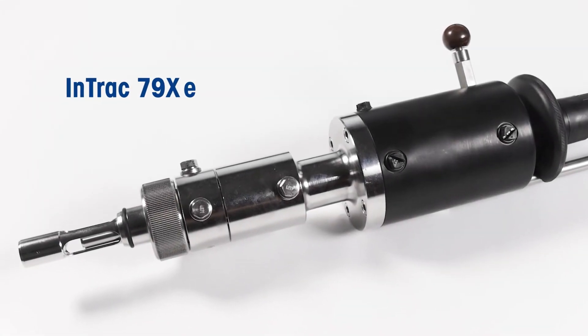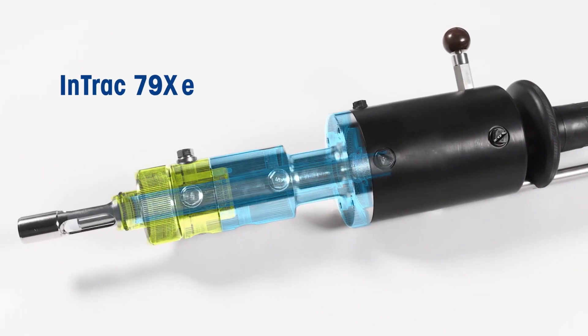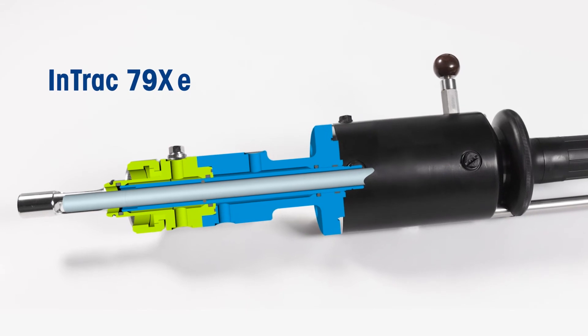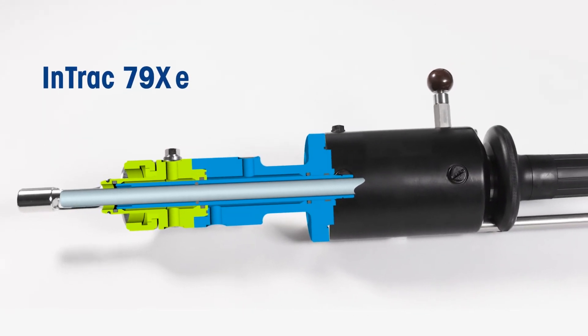This risk can be eliminated with the dual flushing chamber of the InTrac 797E and 799E series of hygienic retractable housings from Mettler Toledo.